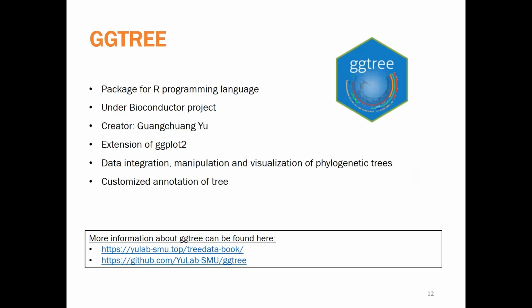And it's really great because there are other tools that we had looked at last week that are online, but the great thing about ggtree is that it's completely customizable and programmable. So you can have a custom tree available that is reproducible as well.